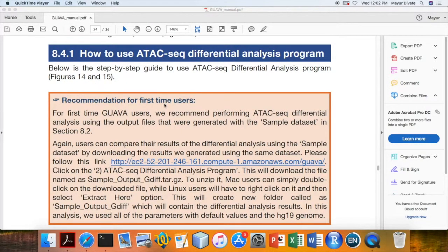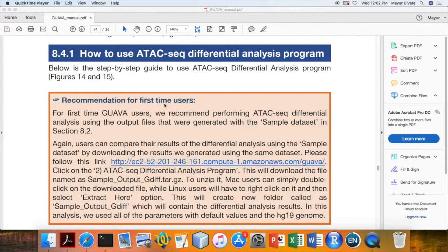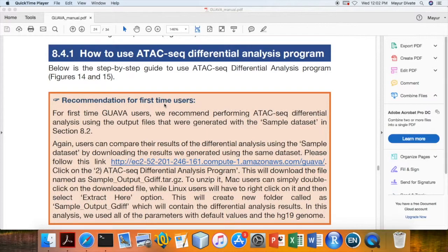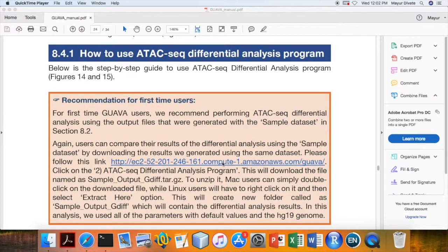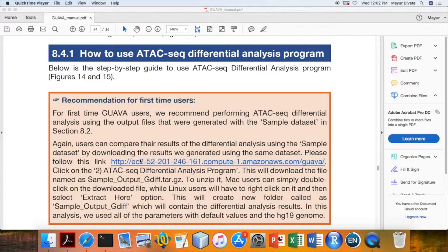To use this program, first you will need to process all the samples using GUAVA ATAC-seq Data Analysis program. Then you can use the output of that program to run the Differential Analysis program. Here I have already processed all the samples using ATAC-seq Data Analysis program. Now I am just going to run ATAC-seq Differential Analysis program.